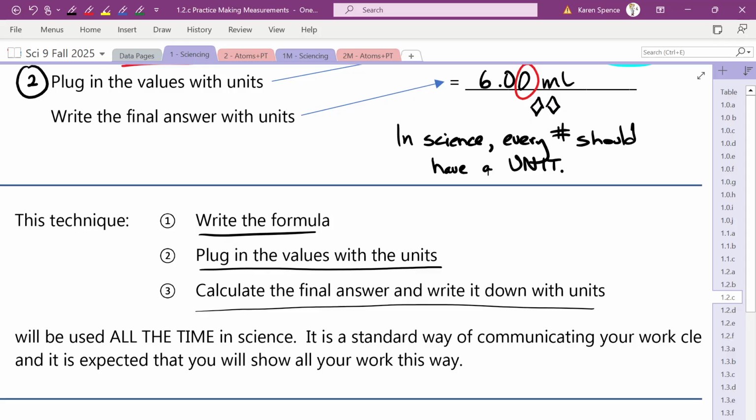However, I did want to go through one safety rule because it is possible that someone might drop something that's made of glass, because we are going to use a beaker to hold our water, right? So it is possible you could drop it. How do we deal with broken glass in the lab? You pick it up with your fingers and get them all bloody and shredded to smithereens. Or what would be a better choice? Eat it. We use a dustpan and a broom.